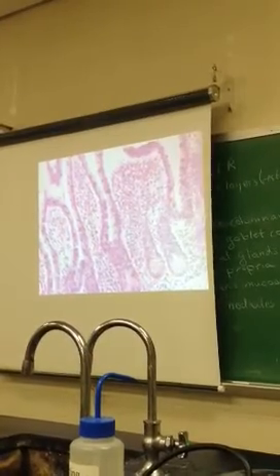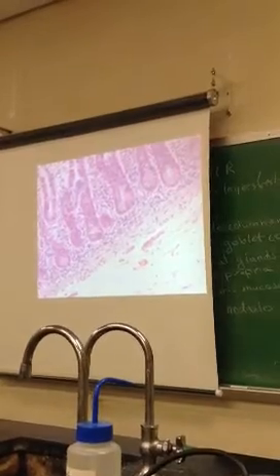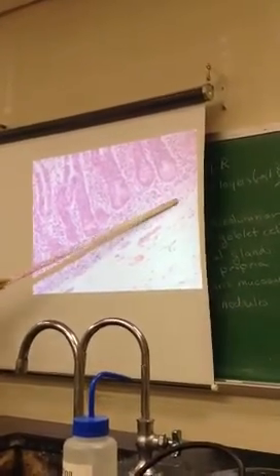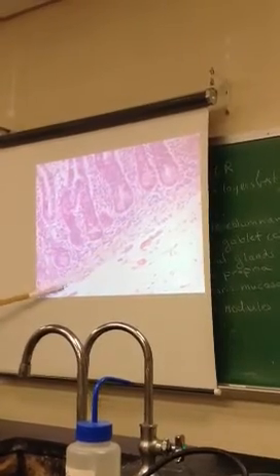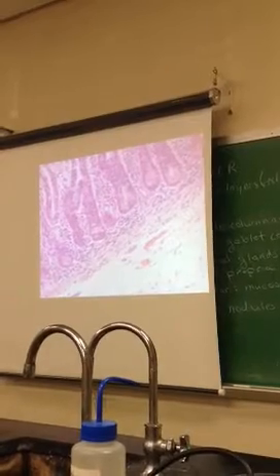And again, they can be further down. We're running out of room. In that mucosa layer. And then here is that muscularis mucosa right there. And what would this be? Submucosa.